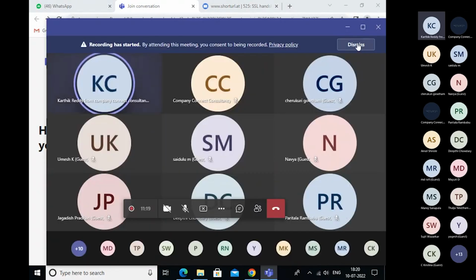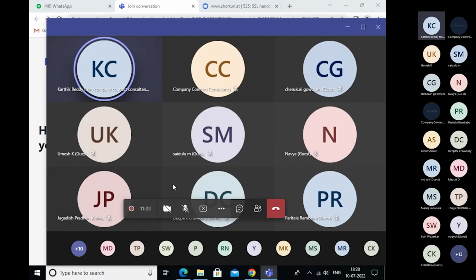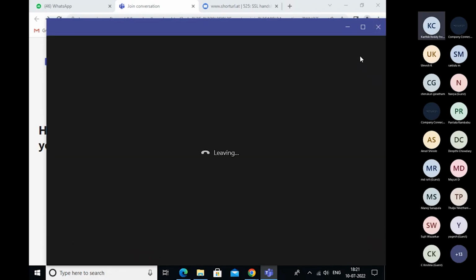After that, once the analyst qualification module can be validated, we will do all the analysis, and personal training records, everything is generated in LIMS only. This is how important analyst qualification is. For example, for HPLC, one of the guys recently joined the laboratory. Based on his experience, if he wants to do HPLC analysis, the supervisor can allow him to take the training.